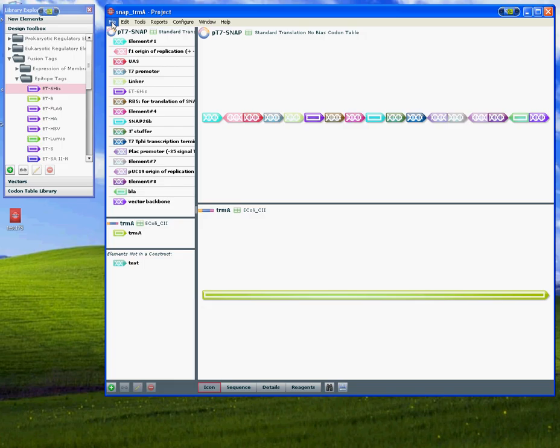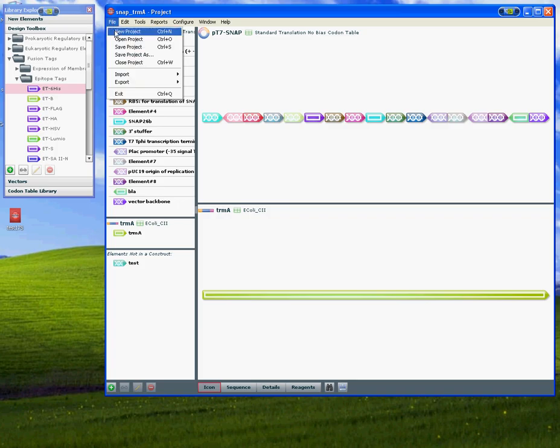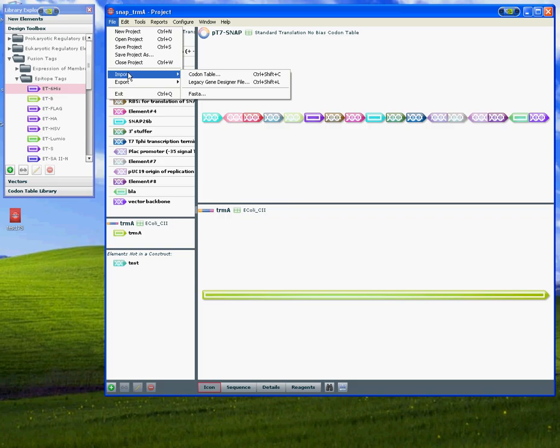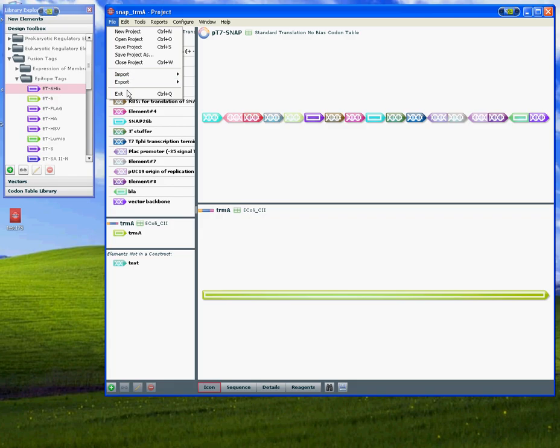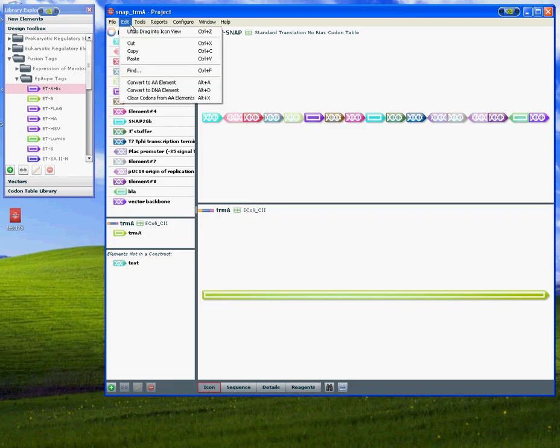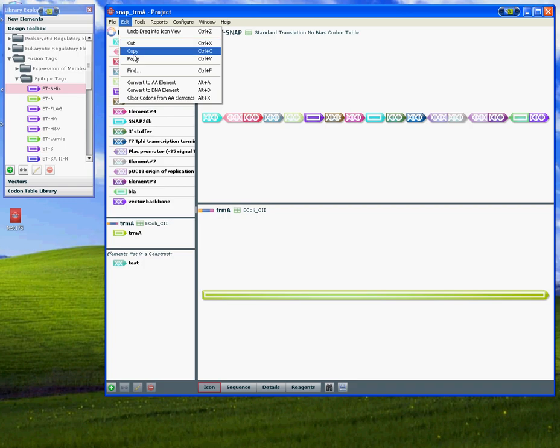From this pull down menu, you can start new projects, open existing projects, save projects, and so on. There's the import and export function, and in the edit view you can undo, cut, copy, and paste.